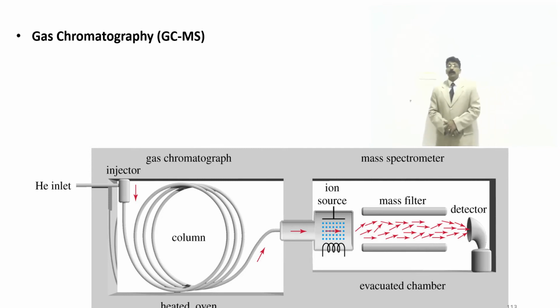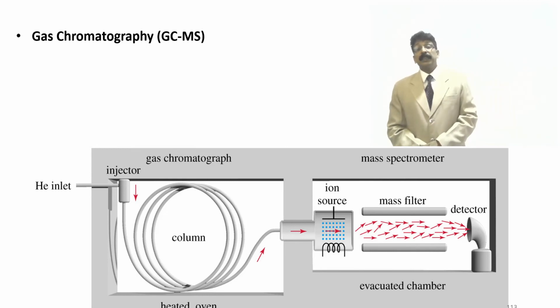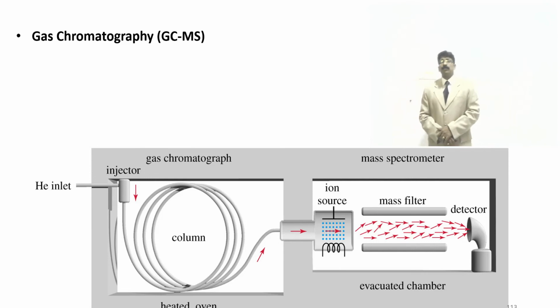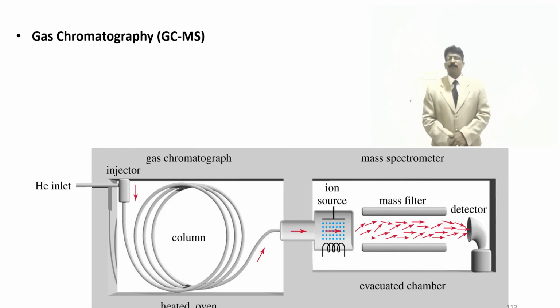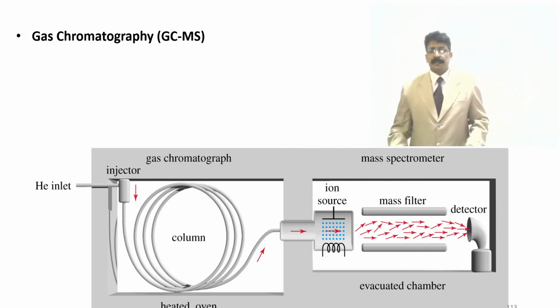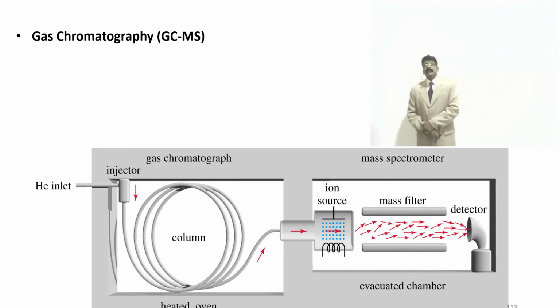The fingerprint and the chromatogram obtained from GCMS are very interesting, and it has been a very sophisticated instrument for more than 3 decades. Starting from chromatography, gas chromatography connected with mass spectroscopy is one of the instruments that has been the subject of lots of papers and research. Anyhow, we are giving a short application with just 2 slides, and I am just explaining gas chromatography.